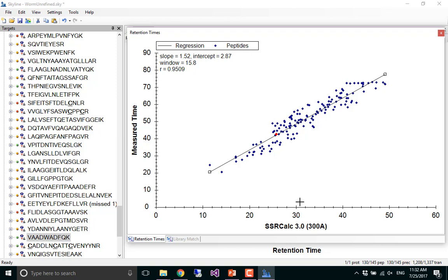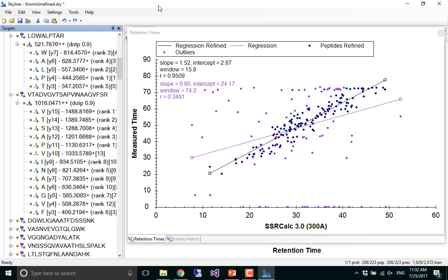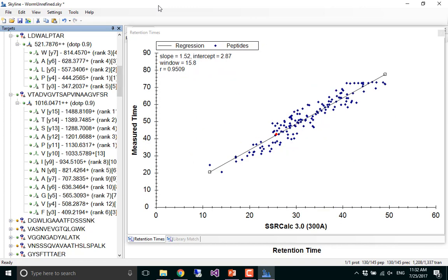It removed 800 peptides? Transitions, probably. 40 something. So if I go Control Z, I can see that I had 223 peptides. Control Y, I end up with 145. So about 70 something.